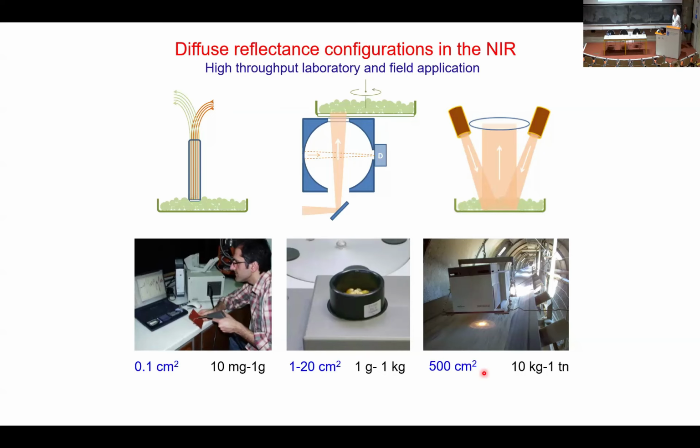For the large scale application, you mentioned that you can seal off the unit with glass, so then the water isn't an issue. But the water would still be an issue on the sample itself, right? So if you have a thin film of water on the surface of the clay, that would be an issue. Is that correct? I consider the water on the sample as part of the sample. Okay. So I'm interested in that water.